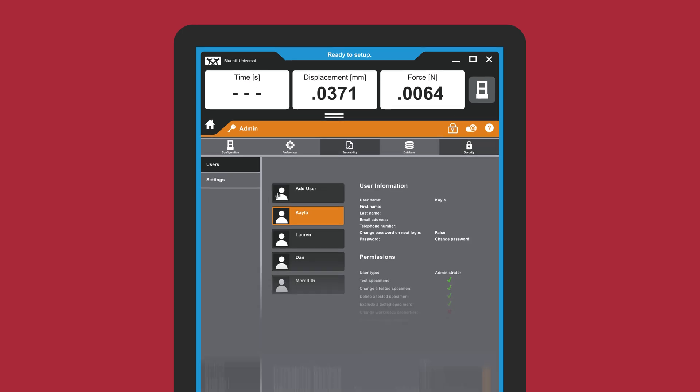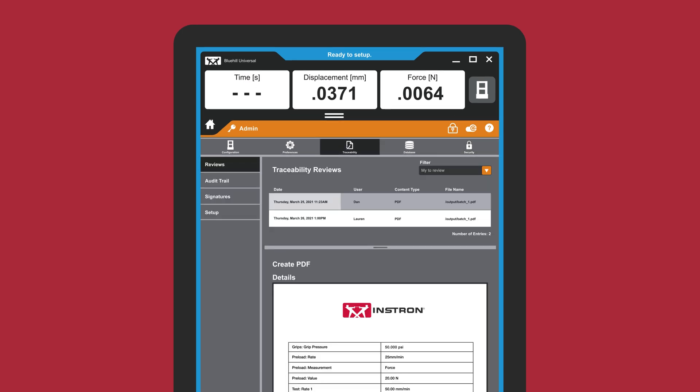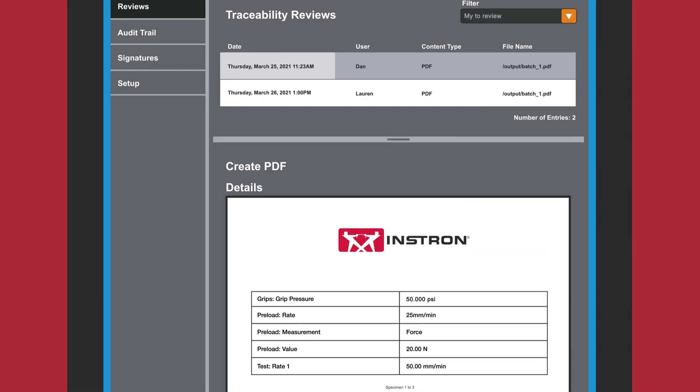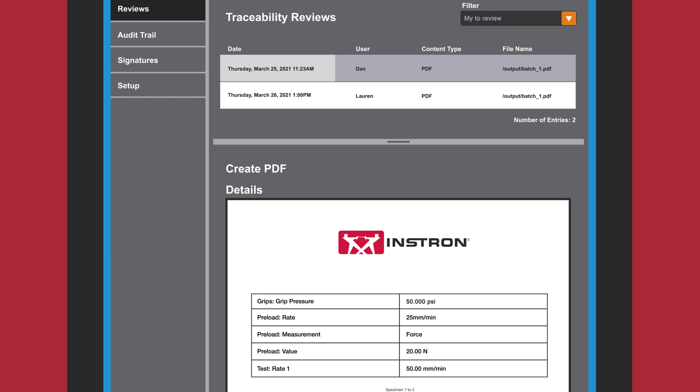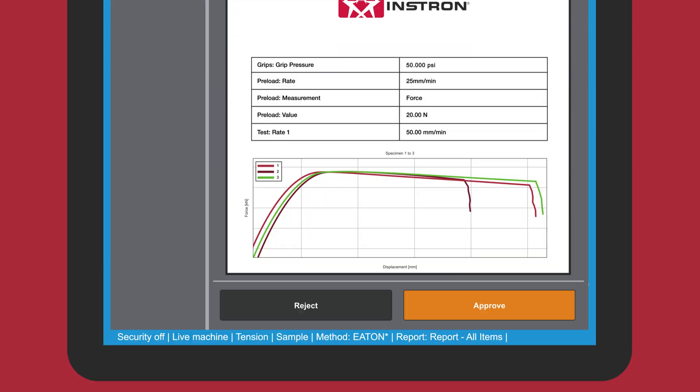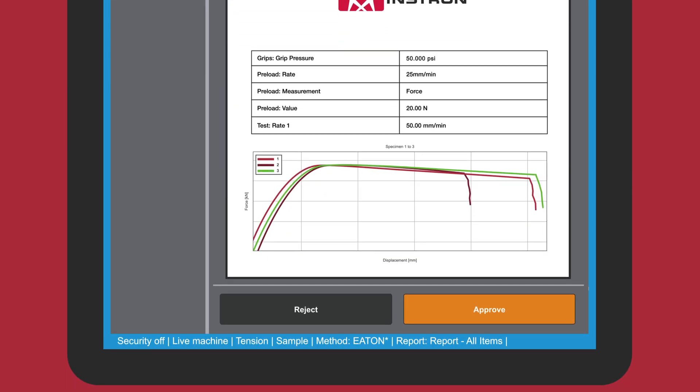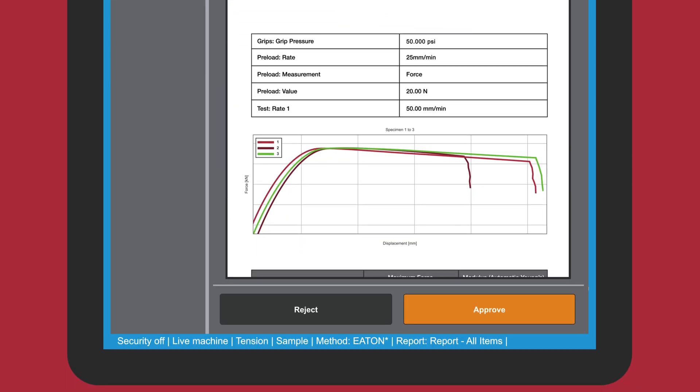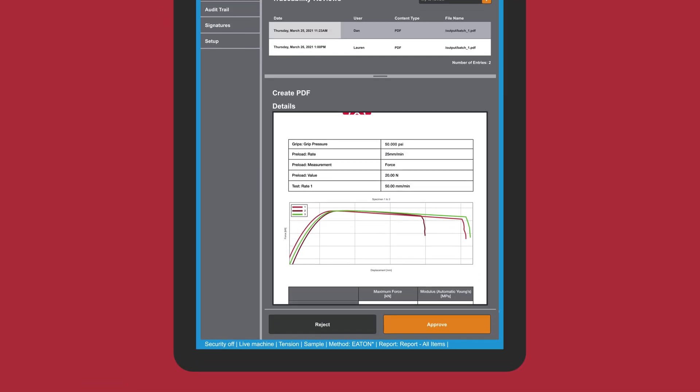Paired with Security, the Traceability module can help regulated labs achieve compliance by tracking file revisions, offering electronic approvals, and automatically recording user actions in an integrated audit trail.